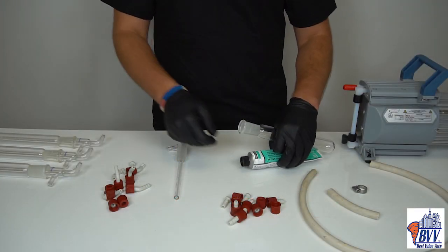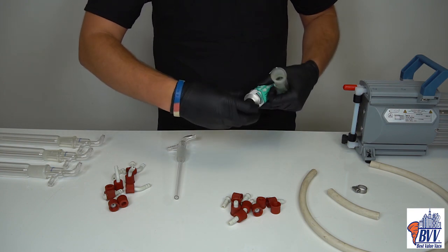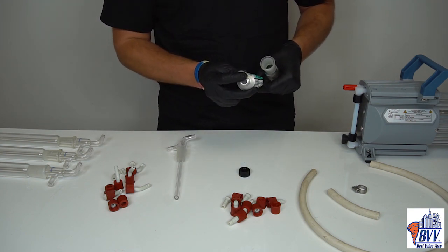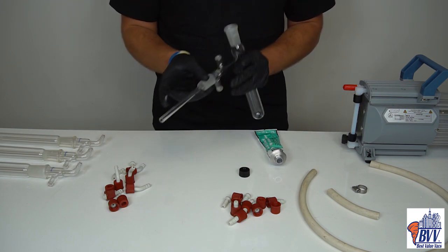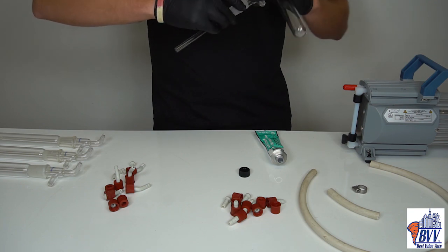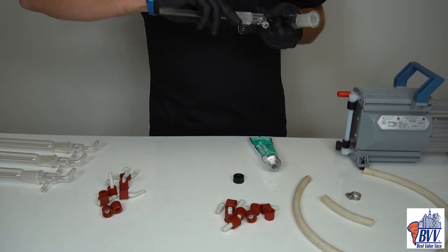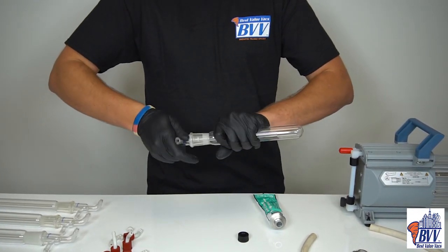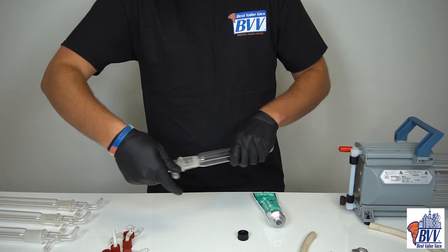The first thing we're going to do is grease our ground joints, as you do with anything. We're using our Dow Corning rated for negative 40 degrees Celsius. If your cold trap is rated for lower than that, you might want to get a more heavy duty vacuum grease, just so it holds up under temperatures. Make sure you get a good seal around that joint.